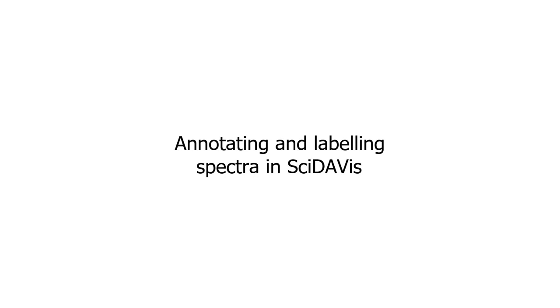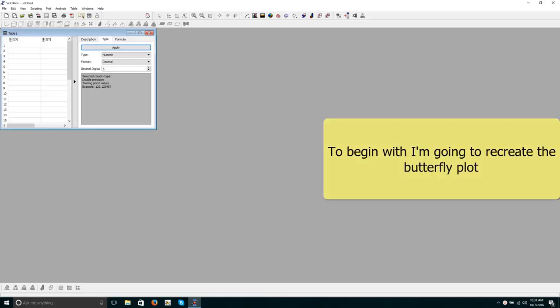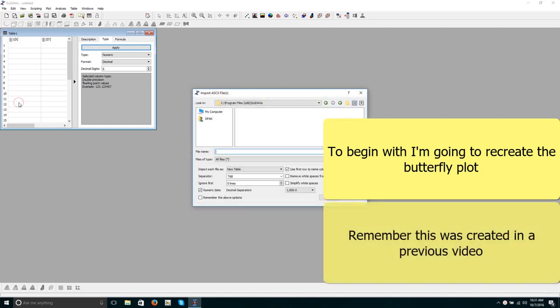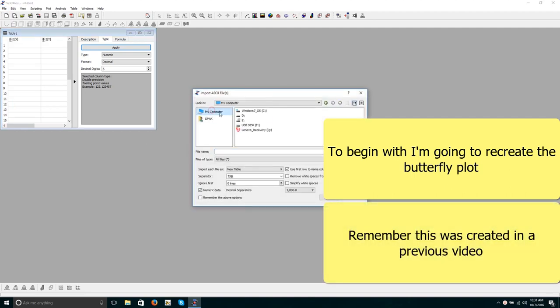This video is to help with SOP 3 and I'm going to cover how you annotate and label spectra in SciDAVis. To begin with, I'm going to recreate the butterfly plot. Remember, this was created in a previous video.